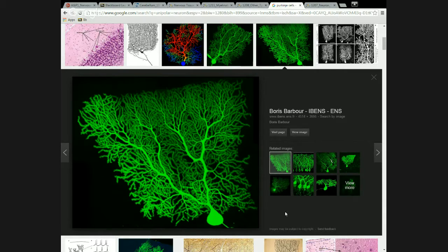But it shows us the cell membrane all the way down to the very smallest diameter dendrite branches that we have at the edge. The way that we visualize this, we use a fluorescent microscope, which will excite the dye with a specific wavelength light laser, and it'll make it glow this colored green. But it makes these really amazing kind of pictures. You can see the whole thing.